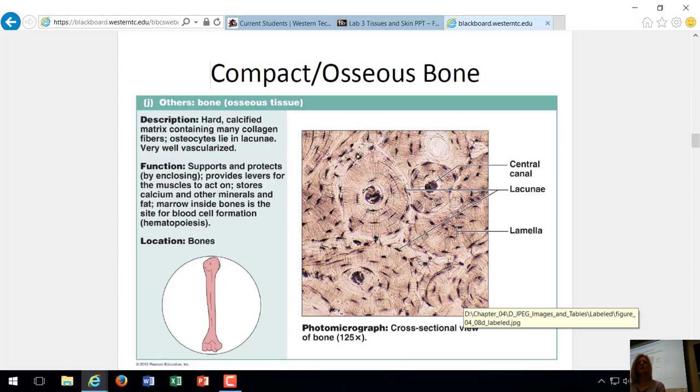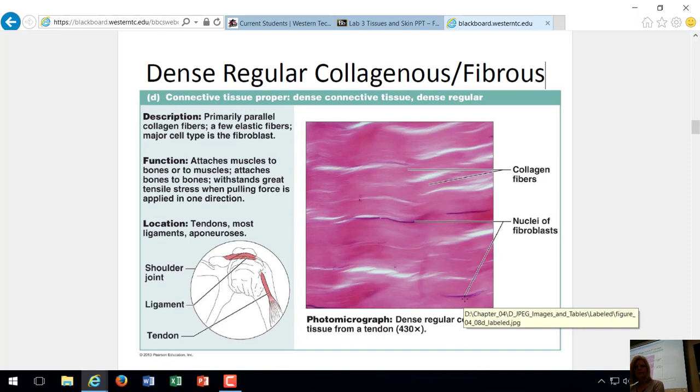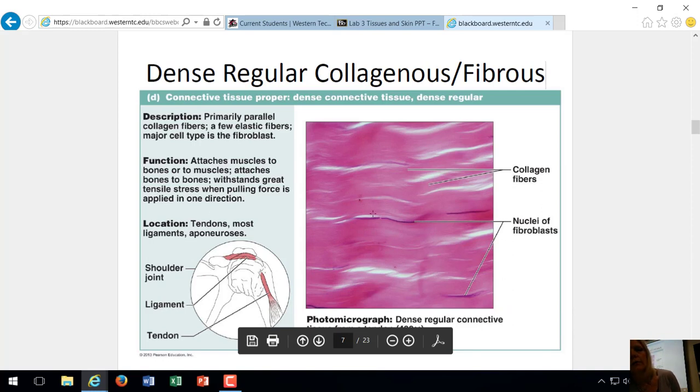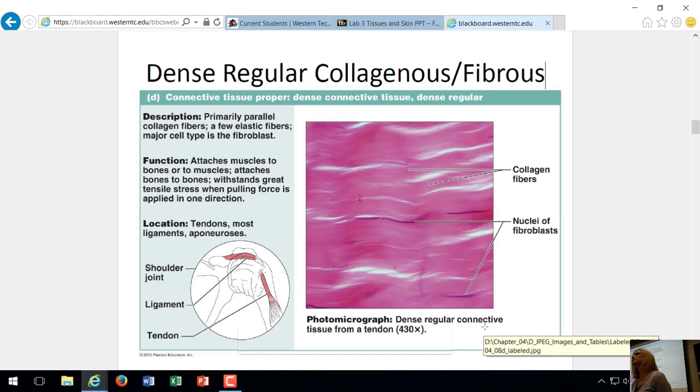Next connective tissue is compact bone. Let me look at this and describe this a little bit. So how do you distinguish this tissue? If you look at the big thick collagen fibers, you can see they're all running in the same direction. They're all going from left to right, kind of a wavy pattern of red collagen fibers. That's characteristic of dense regular collagenous. Those are all collagen fibers. They're all running in the same direction, which gives a lot of strength. So when you pull in that direction, as long as I'm pulling in the same direction that those ligaments are running, there's a lot of strength there. But now if a basketball player takes a quick twist on the basketball court and puts a lot of torque and force perpendicular to those fibers, that's when you see ligament tears. Or if someone in football gets a blow to the side of the knee, that's when you see ligament tears because they're not strong perpendicular to those fibers.